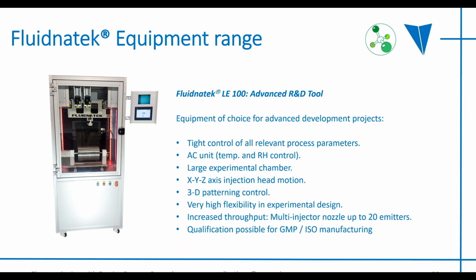Everything can be data logged. It can be supplied with multi-user level access, so that you have an administrative login to change all the settings and set up the experiment, or an operator login where you can just select a pre-saved set of parameters, and they can be loaded in automatically to the machine.